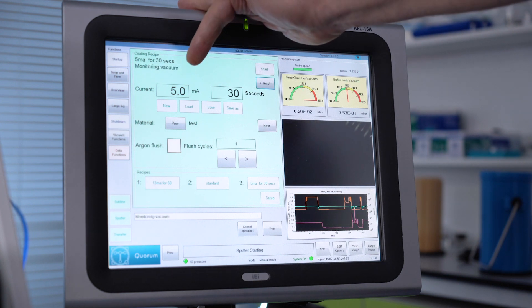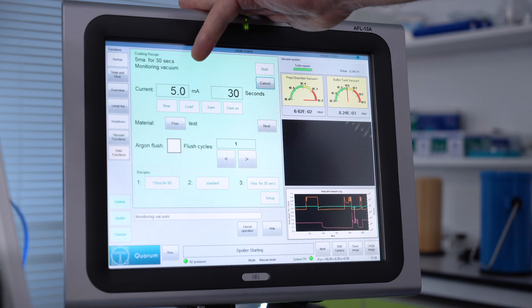So now the system is bleeding in the argon into the system and monitoring the vacuum until it gets to the right level. And then once it sees the argon pressure being correct, it will then turn on the high voltage and look for the current to start.